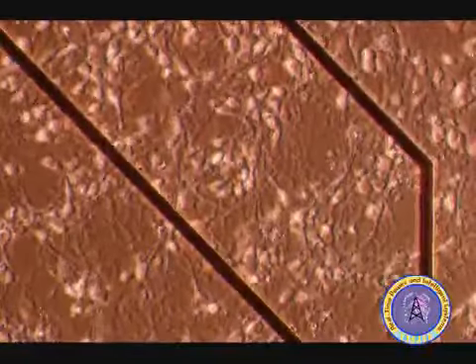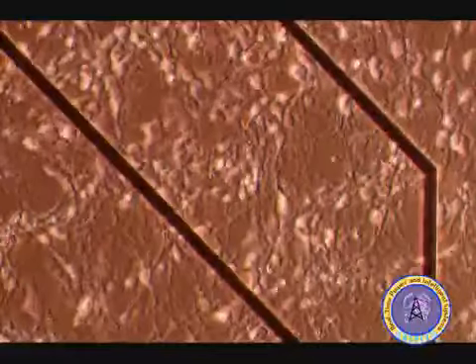by electrically stimulating them. So, in our lab, we have come up with algorithms for stimulating them in such a way that we can train the network to accomplish certain tasks. So we've had these networks controlling artificial animals called animats. They're driving the animats around in an open field, and we give the animat a task to move in a certain direction. And if it moves in the right direction, we give it a certain kind of stimulation. If it moves in the wrong direction, we give it a different kind of stimulation that will train it, hopefully, to move in the right direction. So we've got different types of electrical patterns that we use to stimulate these networks, and we were able to get them to learn to control the animat to move in a certain direction.